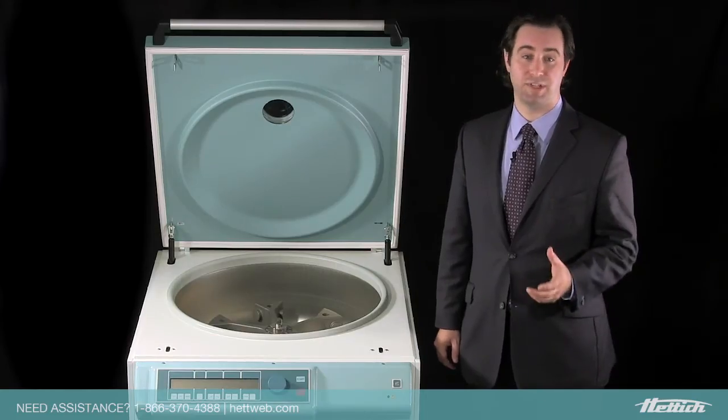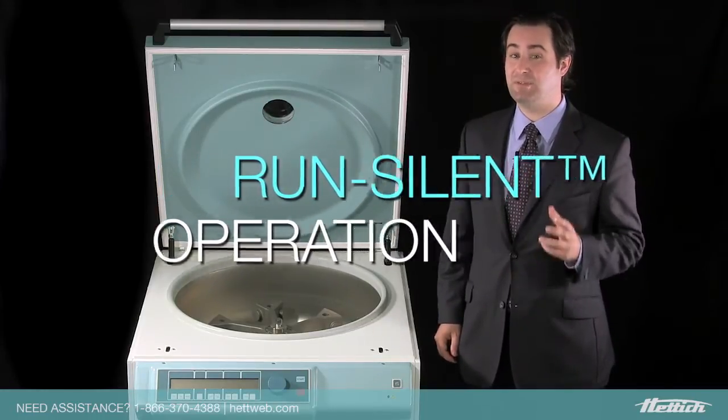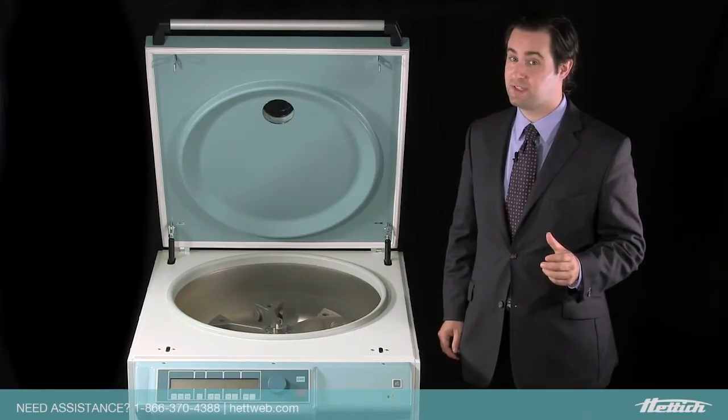Like all of our centrifuges, the Rota Celenta features run-silent operation. This means that even at maximum speed, the unit is as quiet as a normal conversation.